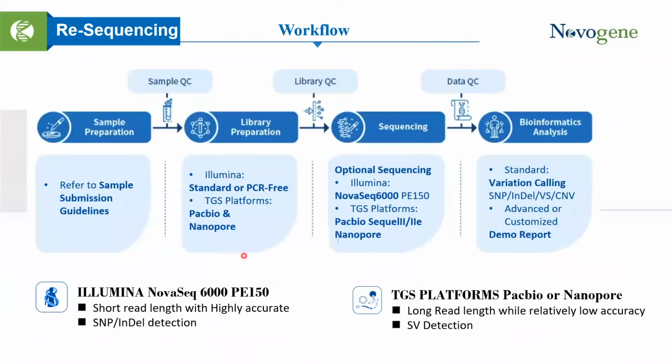Here, we presented our optimized resequencing pipeline from the sample submission to library preparation, sequencing, and bioinformatic analysis. So we conduct the quality control prior to each process individually to ensure that the samples or the data are qualified and quantified for the following performance.